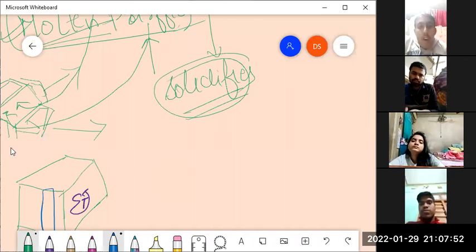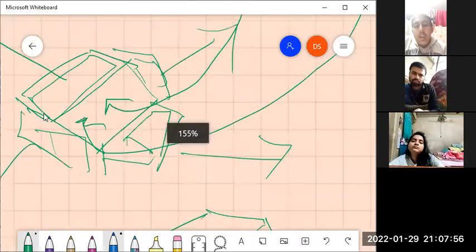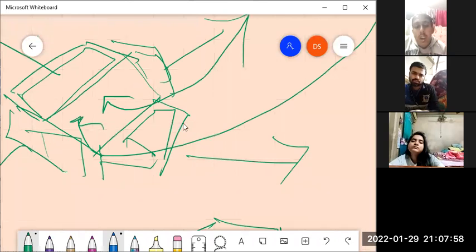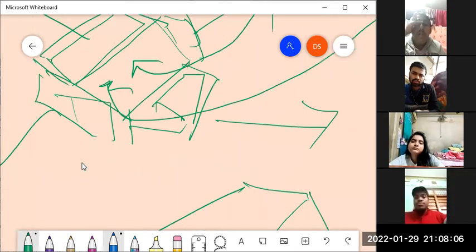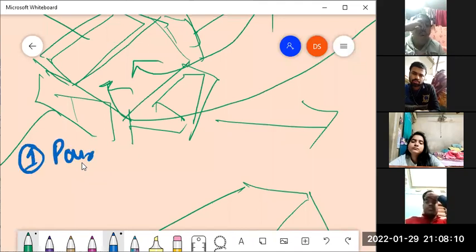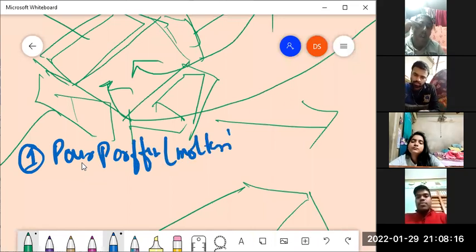So when we are initially preparing this block with the help of these plates from all the sides, first we pour some amount of paraffin. So let me numerically order these steps. Pour paraffin, molten, not to the full, but only in part.